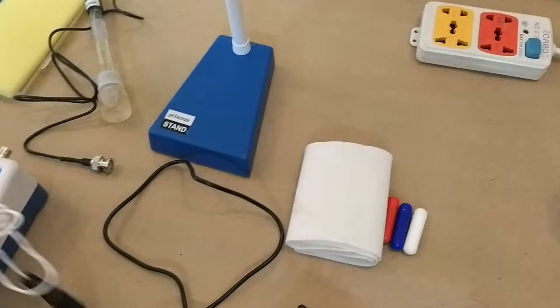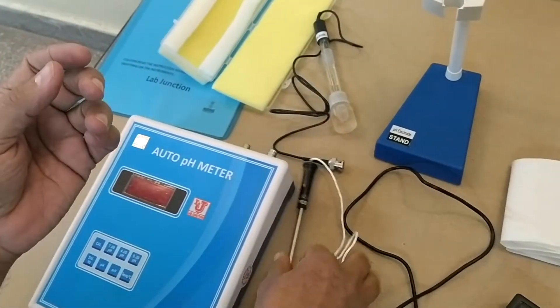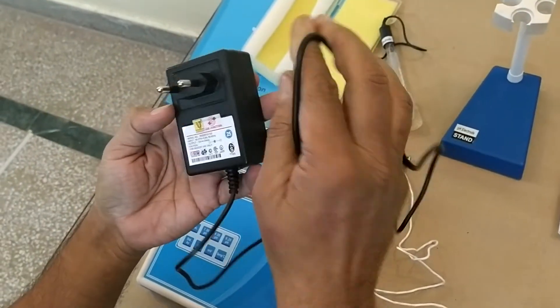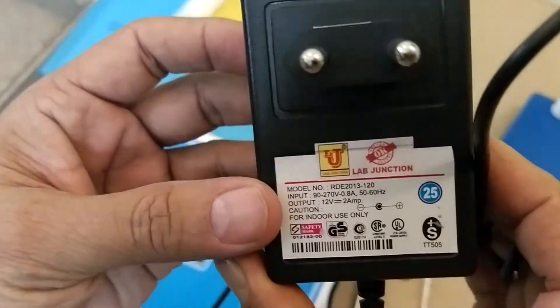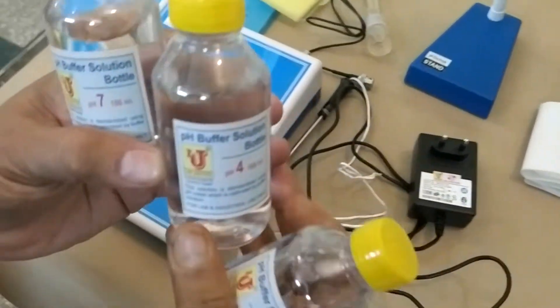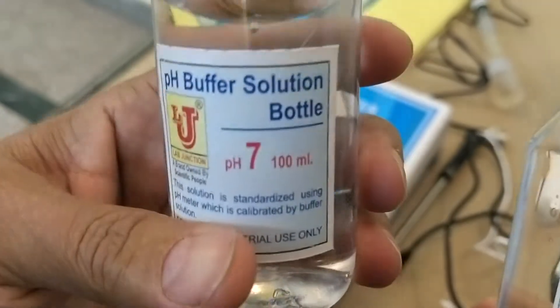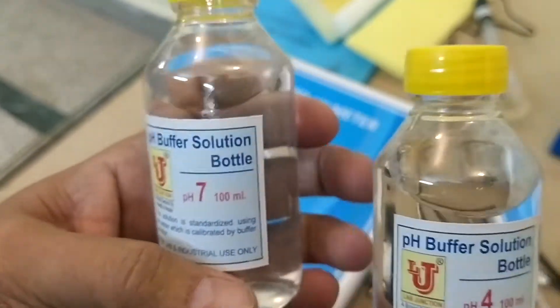This is the temperature probe. This one is the adapter for the Lab Junction Auto pH Meter. These are the standard solutions for the calibration of the Lab Junction Auto pH Meter.